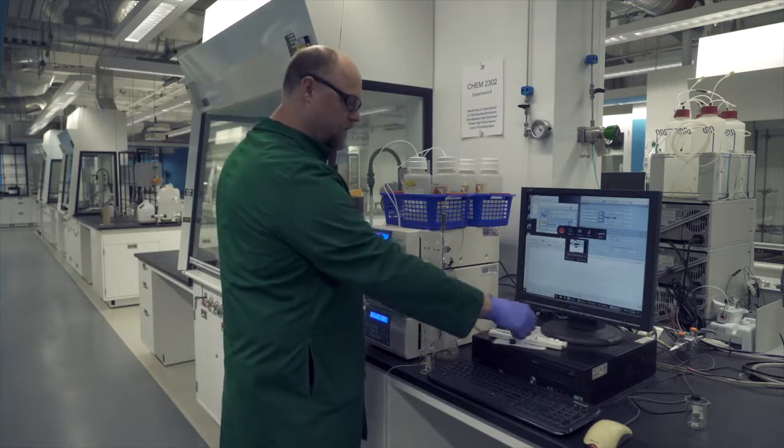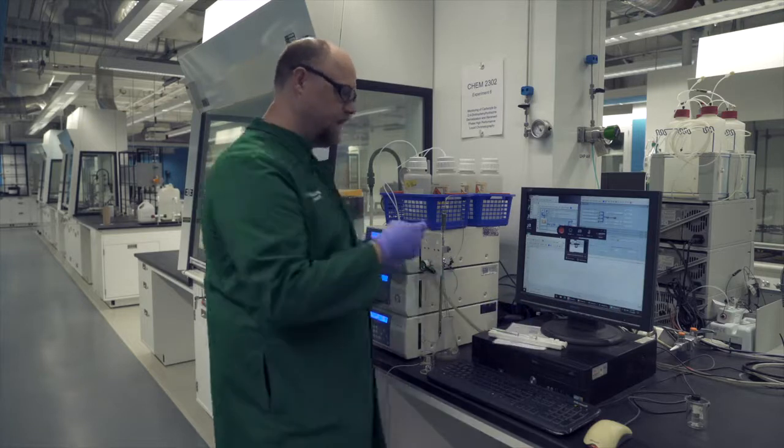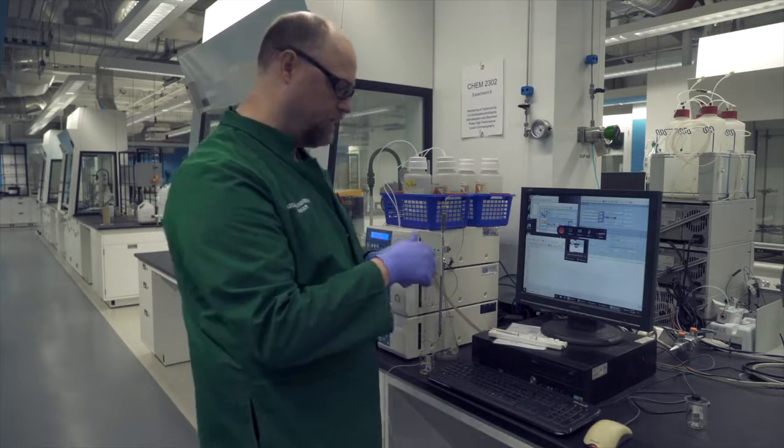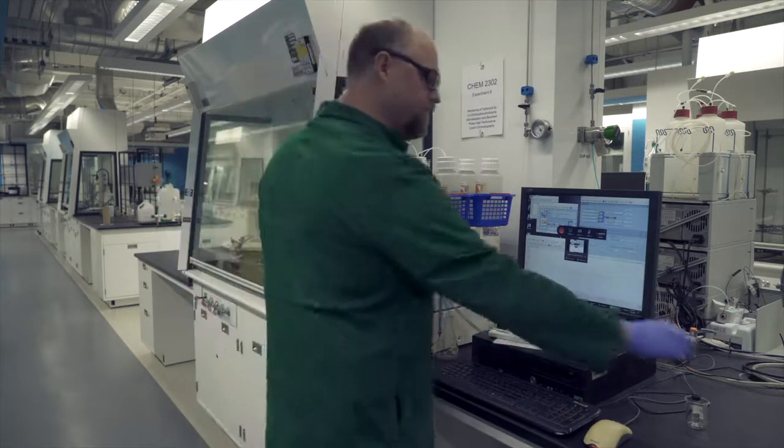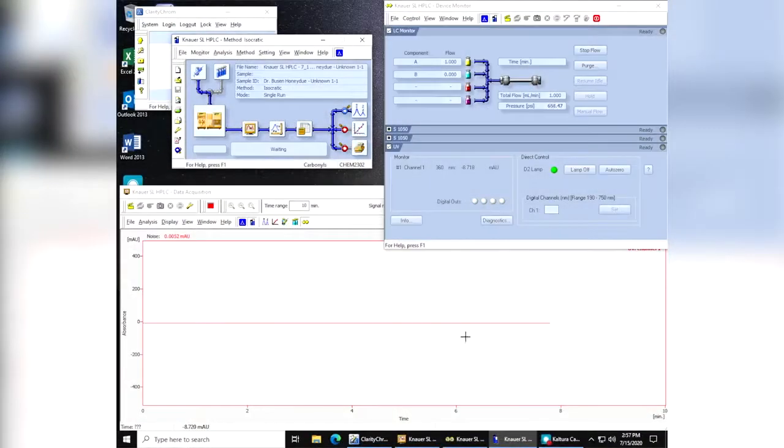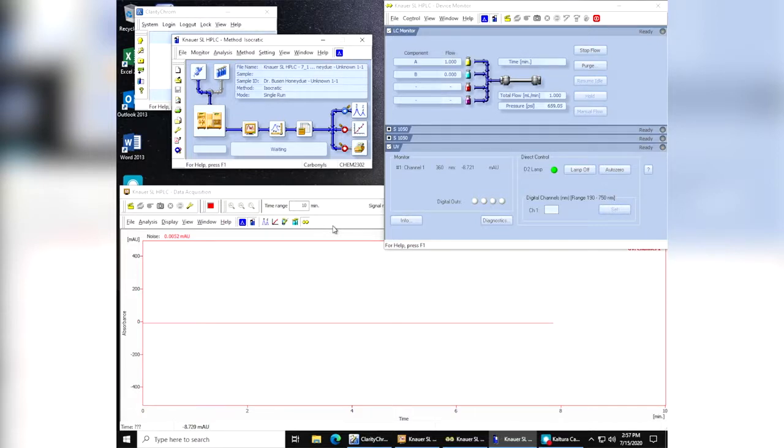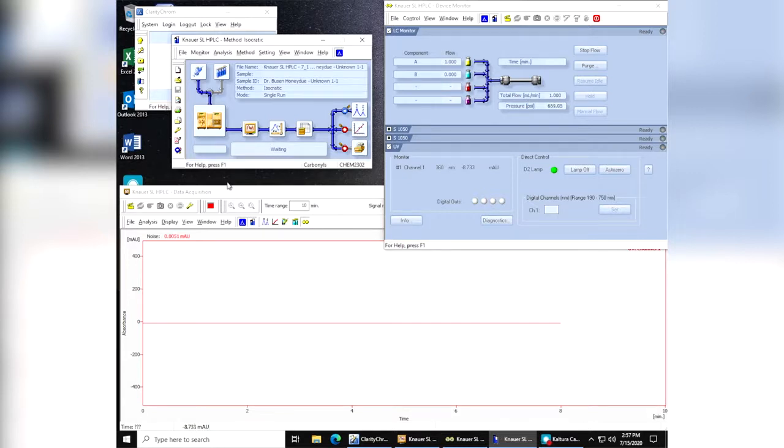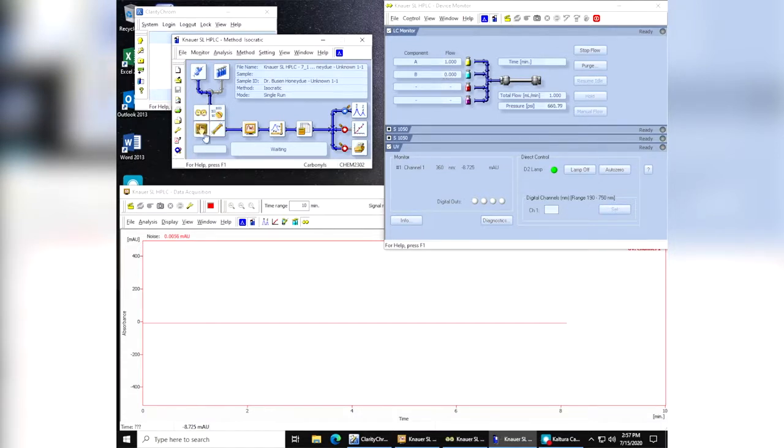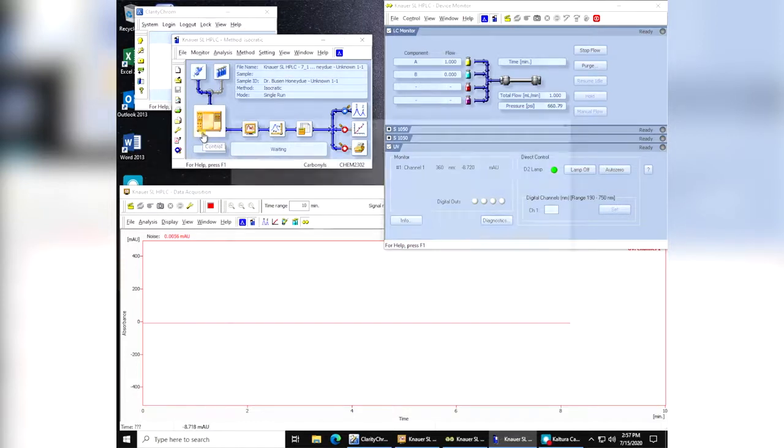The next part is to set up the computer so that the computer is ready to do the injection. Alright, so here you have the software running for the instrument. What we're going to do first is we're going to want to set up the instrument, the components of the instrument here, so that it's running the right method that you're going to want. Depending on the course, you can talk to the TA or myself as your lab coordinator to help you get the instrument set up.